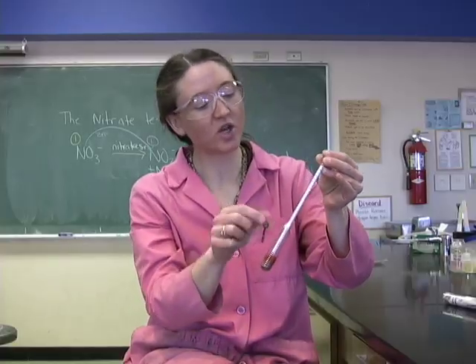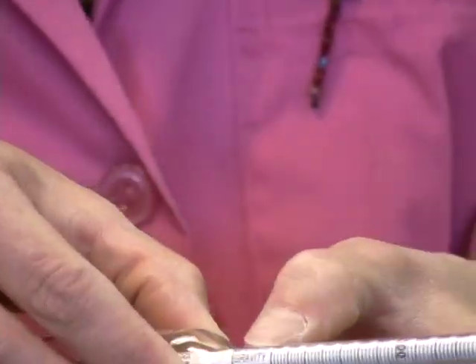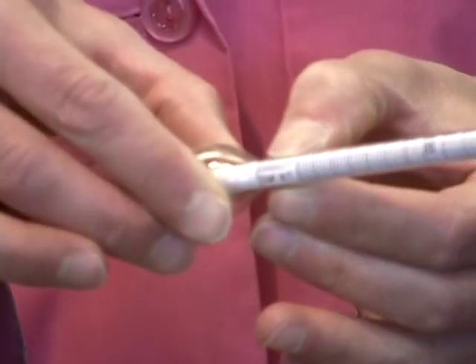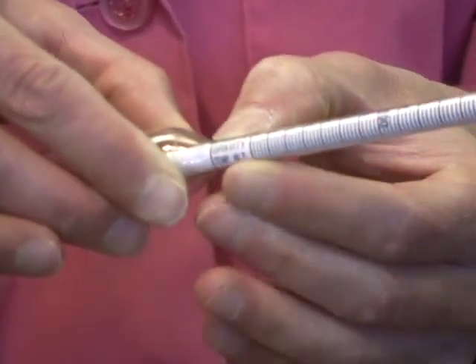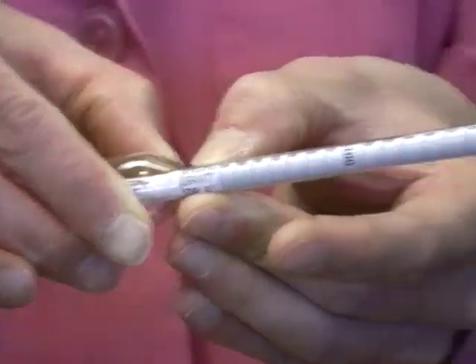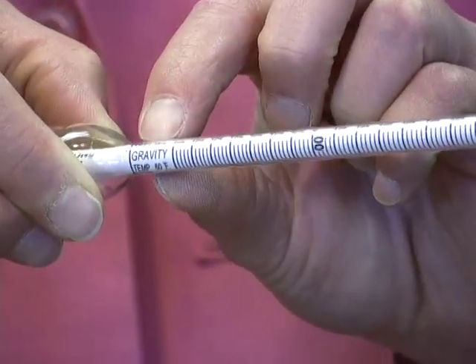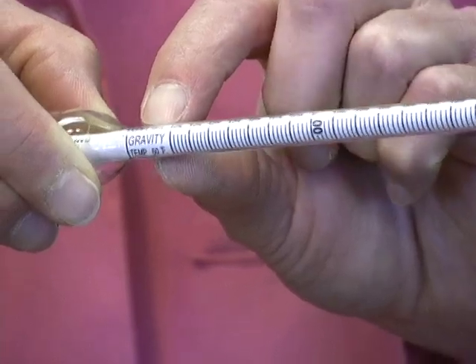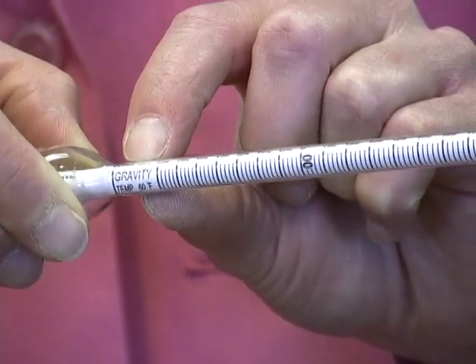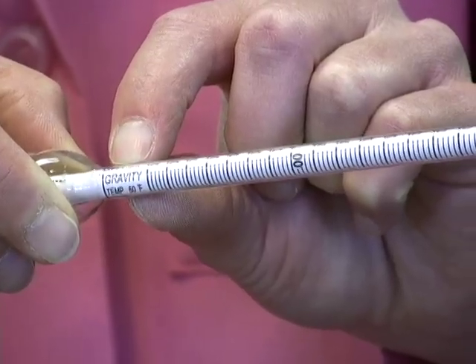If you come in a little closer, you'll be able to see which scale we're going to be using. This is the scale that you want. You can find it labeled at the bottom here: specific gravity. That's the scale that we're going to be reading. It can be a little bit confusing in terms of how the gradations on the scale are labeled.